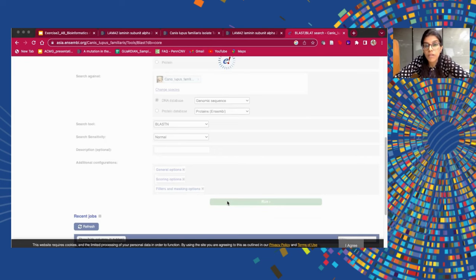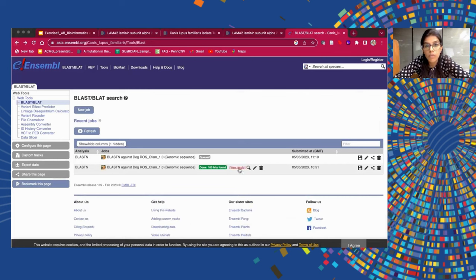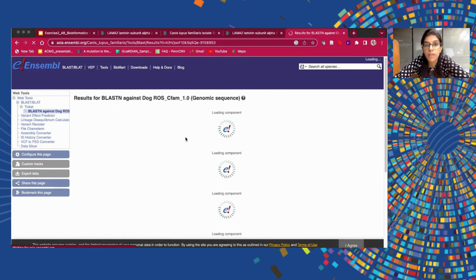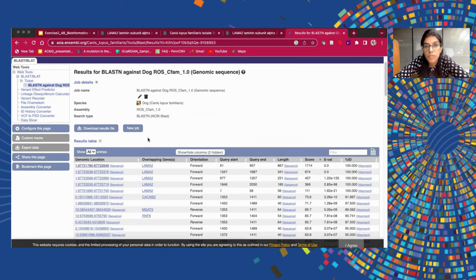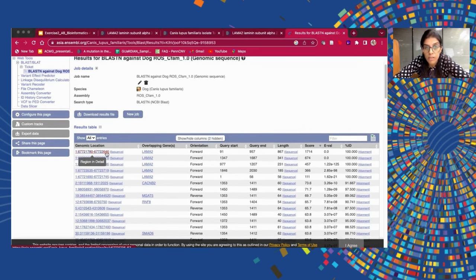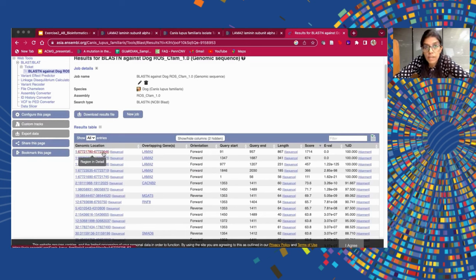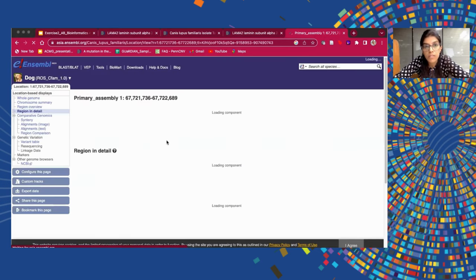This takes quite some time — somewhere around 5 to 10 minutes depending on internet speed. So we will view the older BLAST results that I had already performed before. If you click on that, it will redirect you to a page showing the job details — that we had done a BLAST against the dog genome sequence using BLASTN. Once we get the results table, you can see there is an E-value which is supposed to be very low. An E-value of 0 and a percentage identity of 100 is ideal. We select the first genomic location, as it has the most hits and 100% sequence identity.